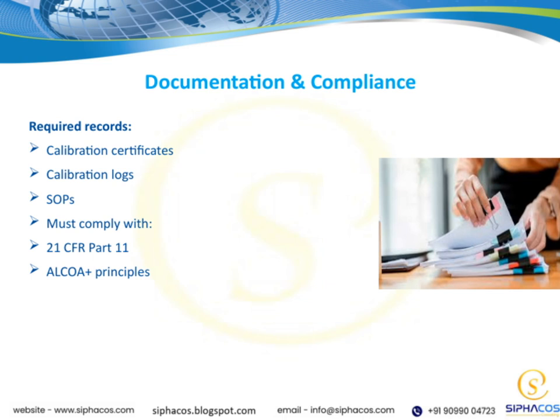Now, compliance isn't just a matter of good practice. It's a regulatory requirement. We need to adhere to 21 CFR Part 11, which governs electronic records and signatures, ensuring data integrity and security. Plus, we follow the ALCOA Plus principles, which emphasize that our data must be attributable, legible, contemporaneous, original, and accurate, with additional factors like complete, consistent, enduring, and available. All these elements come together to support our overall goal of maintaining high quality, integrity, and regulatory compliance in our operations.